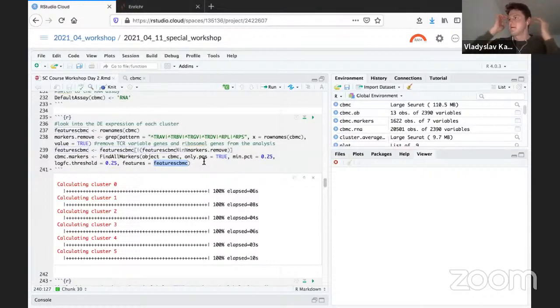Good. So the next question, as I see, is it possible to do single-cell RNA sequencing in fixed cells? Yeah, the next question is what are you using for fixing your cells? Because it's very crucial for the RNA integrity. Maybe you can specify which solution you are using for fixing the cells, in the chat.